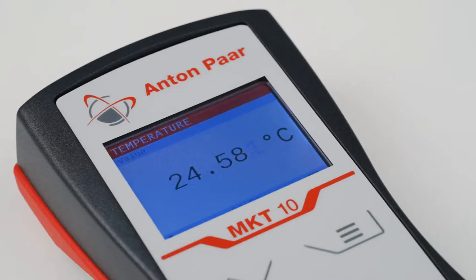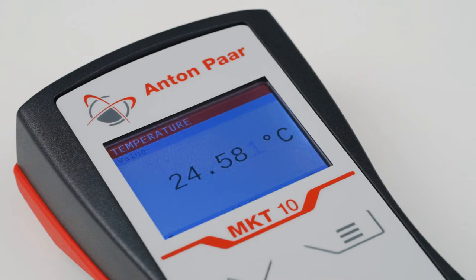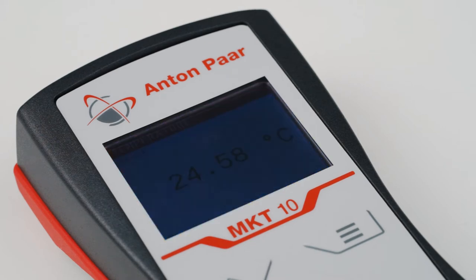In order to prolong battery life, the instrument will automatically switch from active state to idle state after a specified time.